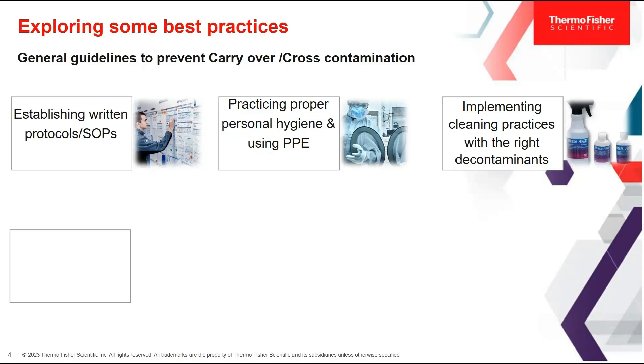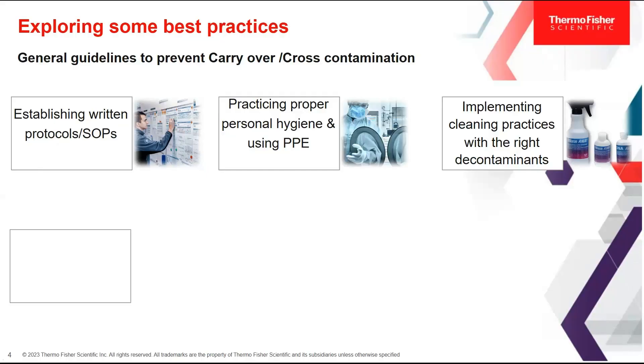Next, practicing proper personal hygiene — such as washing hands, wearing clean lab coats, using gloves correctly, wearing face shields and masks, avoiding touching of the hair, face, and mouth during the experiment, and frequent changing of gloves when handling multiple samples. Another important thing is to implement stringent cleaning practices, such as regularly cleaning work surfaces, equipment, pipettes, and other tools with appropriate decontamination solutions. These can be enzymatic decontaminants like RNase Away or DNA Away, UV radiation, or even 70% IPA.